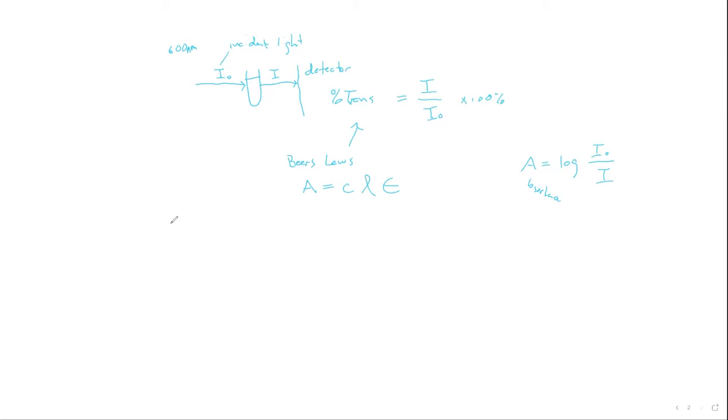And so we're going to create a graph based on the concentration. This is how you make a graph, by the way. So the concentration, M is the unit, and absorbance is over here. And absorbance is unitless.